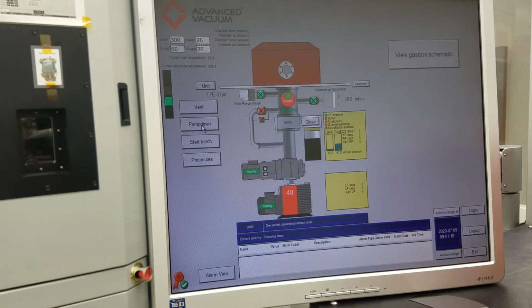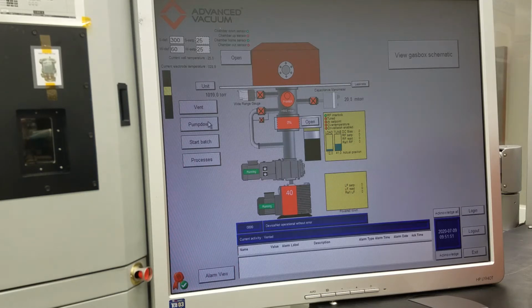The first step is to vent the chamber. Then you will click here, open.